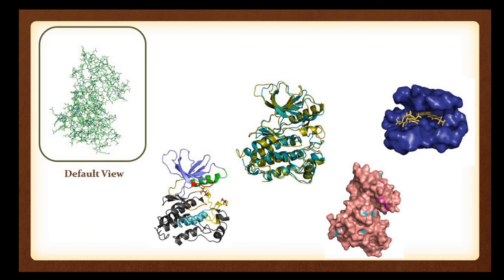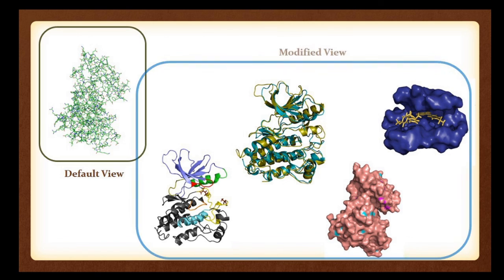Once we open a biomolecule in PyMOL, there is a default view as shown in the encircled area. From there, we can visualize the same protein or biomolecule in different forms, as shown in the modified view. These are the different ways to visualize the same biomolecule properly. We will now go through a demonstration of how to visualize a protein in a better way.